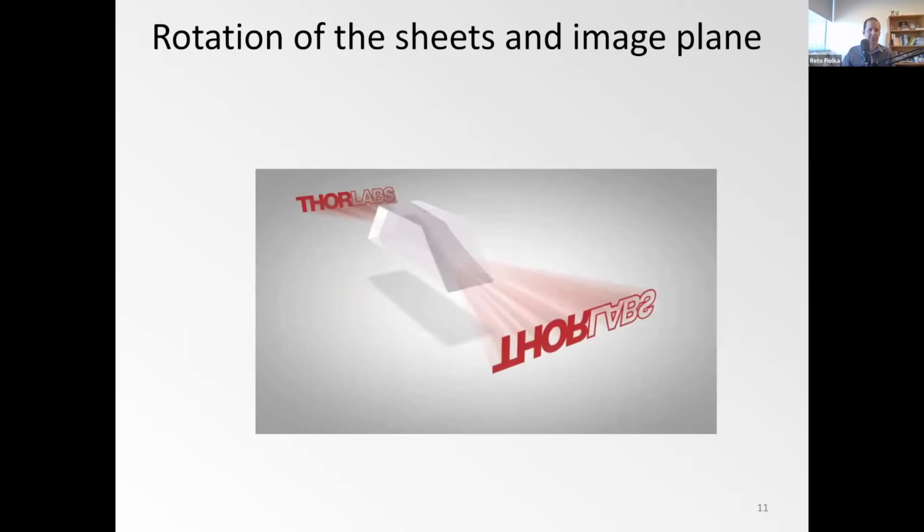I will go over where one could actually place that, and mechanically rotate it. This would still be not very satisfying because mechanical rotation is still time consuming, and the block of glass is also annoying. It would cause some dispersion. It would also cause some aberrations because the light rays in the microscope have a certain divergence angle, and as they go through that block of glass, they would probably pick up at least some spherical aberrations. So in principle, doable; practically, we would still not be happy with it.